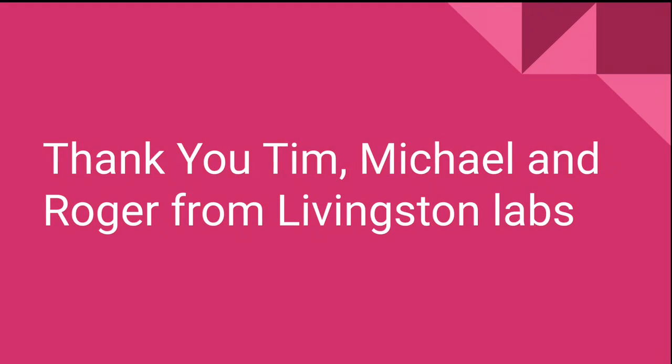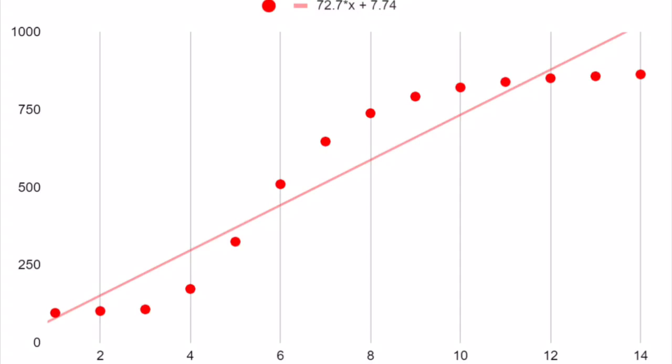With help from our mentors from SFU, we were able to complete this project. They showed us we needed a calibration curve in order to find the right starting concentration. A calibration curve is simply a range of values with known concentrations. It helped us find the lower limit and upper limit of our sensor.